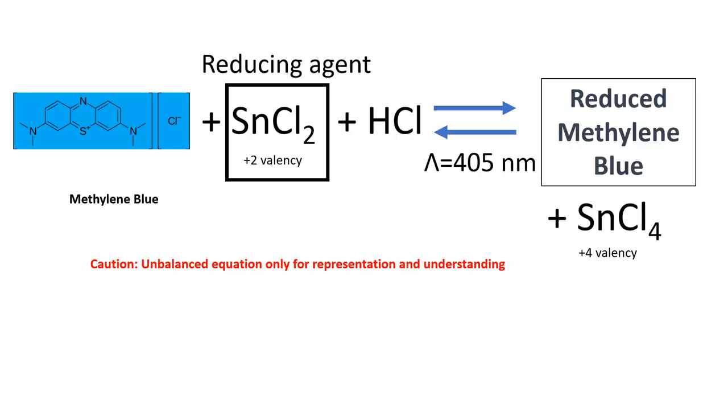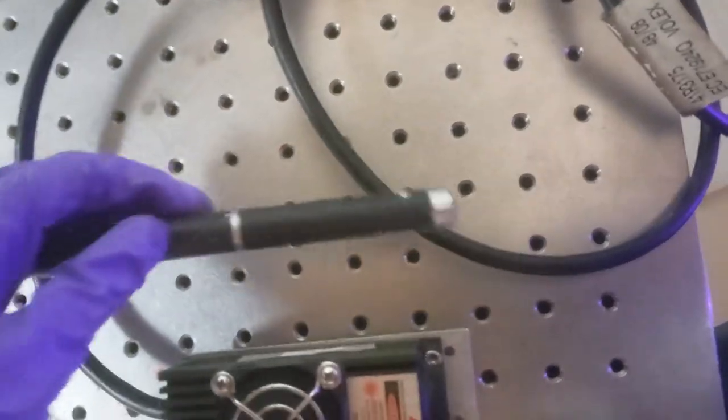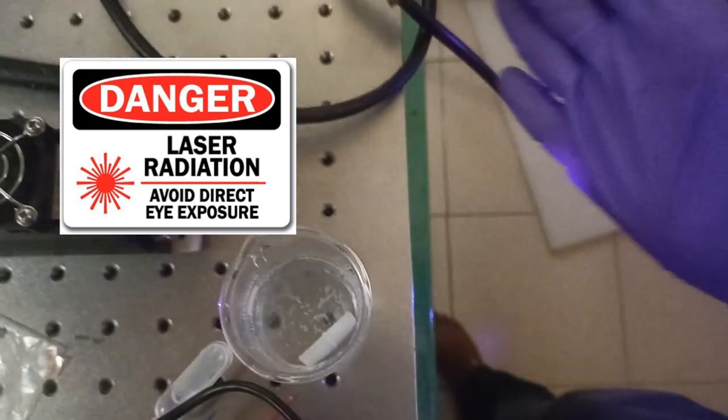This is one example of leucodyes. When you irradiate with light it is changing its color. You can also try using a 405 nanometer laser pointer. This is my 405 nanometer laser. Let's see what we do.